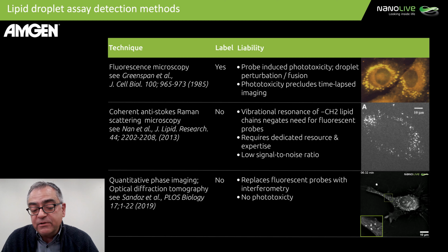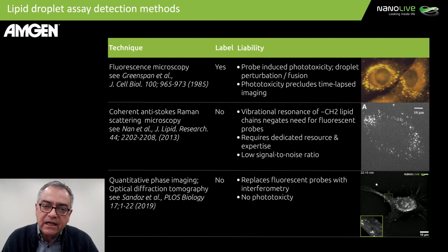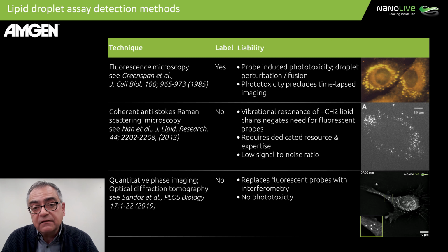I also have a great interest in Raman scattering, and of course that immediately came to mind for investigations such as this. But I don't currently have the infrastructure built to do Raman scattering, and I knew that I would have to hire dedicated staff to accomplish these goals. Stated another way, I knew that if I committed myself to Raman scattering, I'd never really be able to enable an investigator to come into a lab, take their measurements and their data, and go back to their desk.